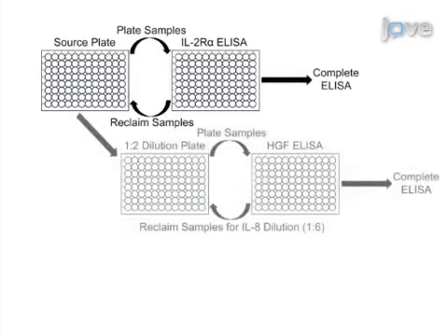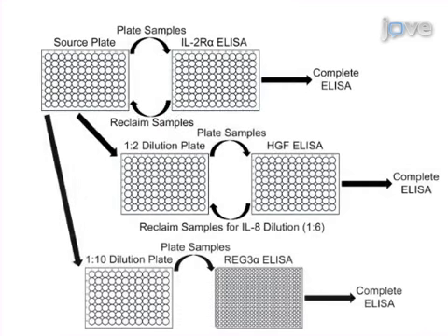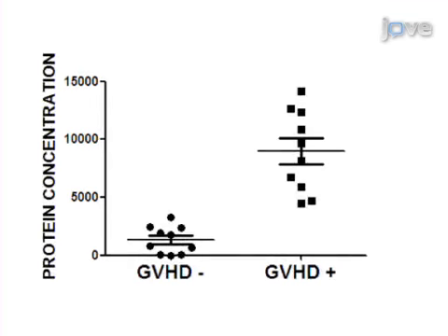Next, ELISAs are run for each protein in order to determine their concentrations in patient samples. Ultimately, the elevation of the protein levels of these biomarkers at the onset of clinical manifestations of acute graft-versus-host disease can be assessed.